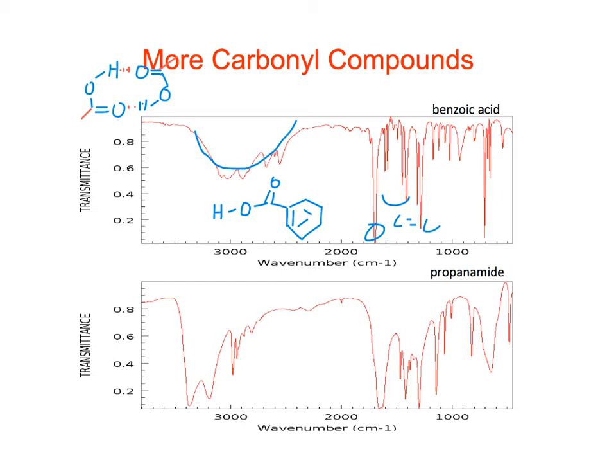All right, and the last one that I have here is an amide. So we see the carbonyl stretch. We see 2 peaks because it's a primary amide. There's 2 NHs. Right? We see the carbon-hydrogen stretches. They're all below 3,000, so we know there's no benzene ring.